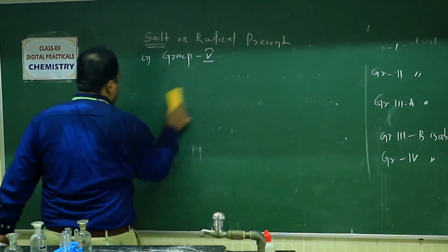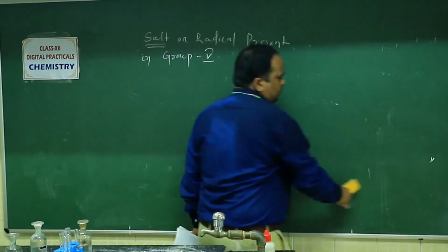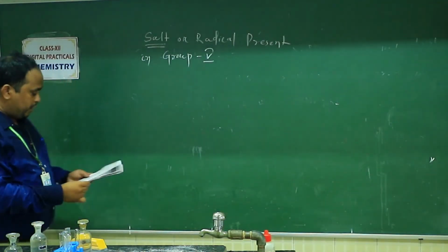Very simple. So for group 5 we have to do individual tests.